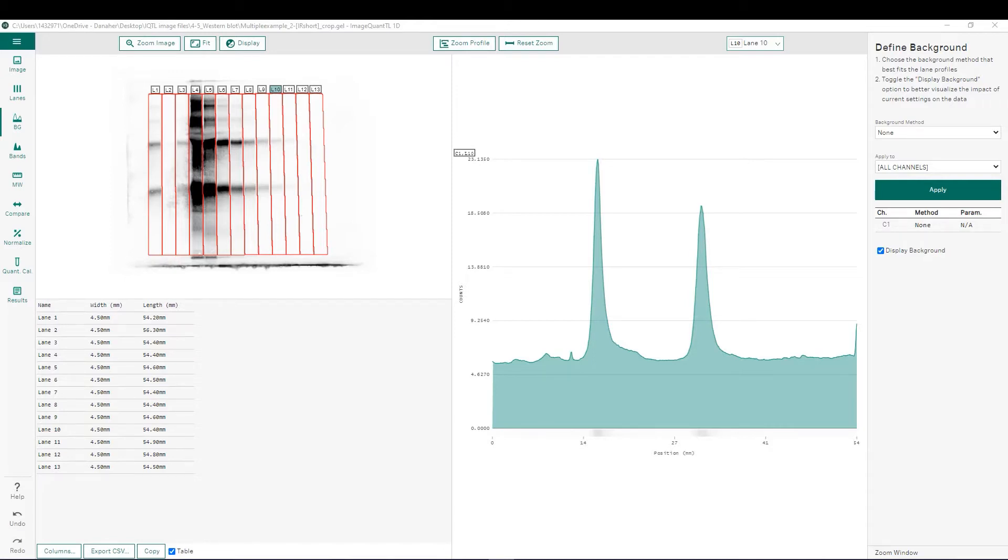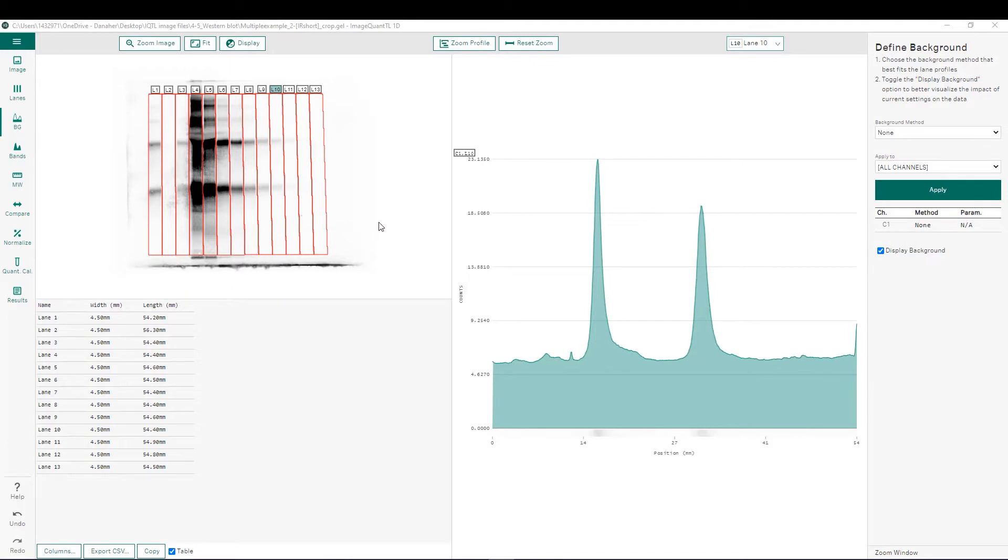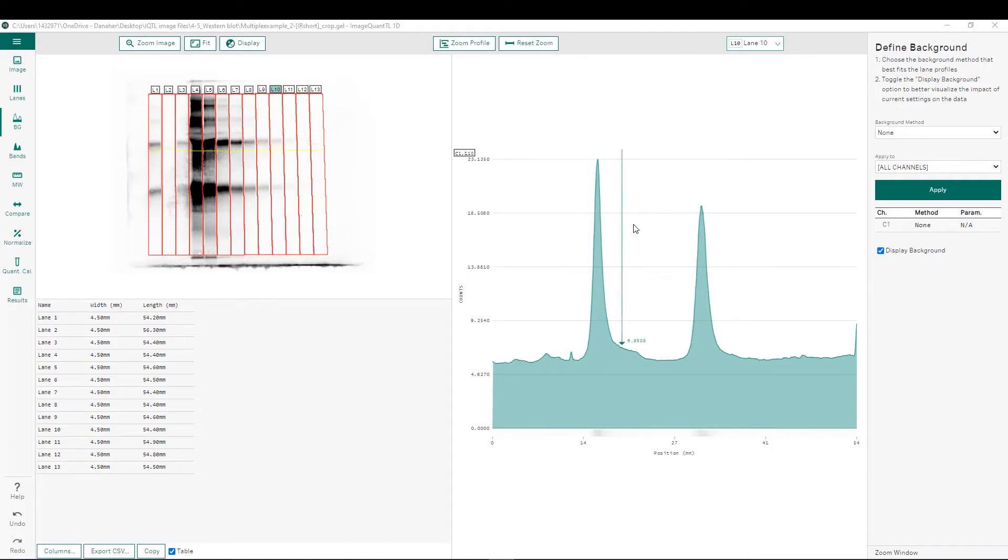In this image, we've already defined our lanes and we are at the background subtraction step. We can see the image that we're analyzing with the defined lanes, as well as intensity profiles for any selected lane. For example, in this case, we're looking at lane 10.